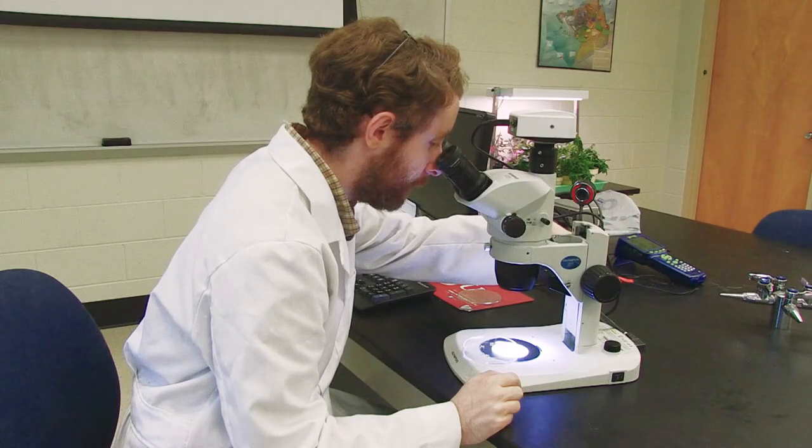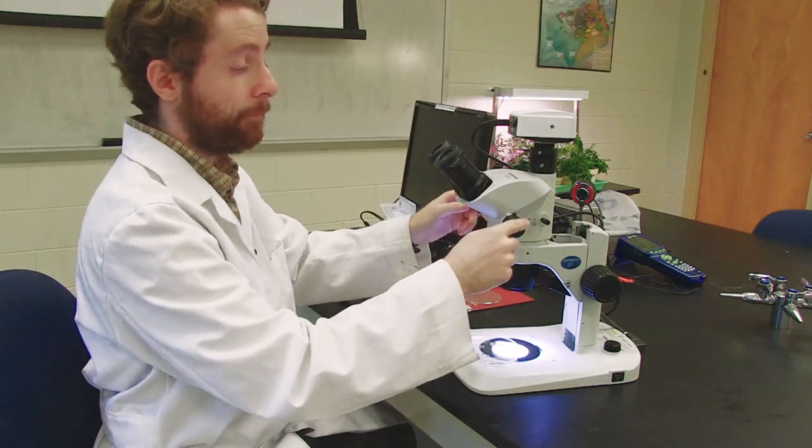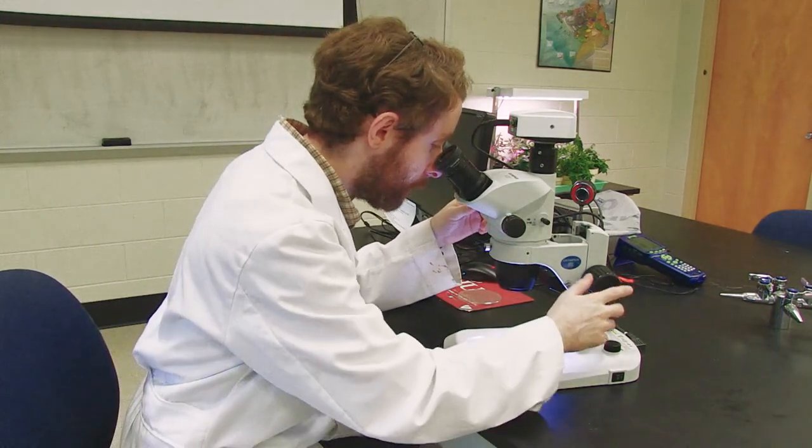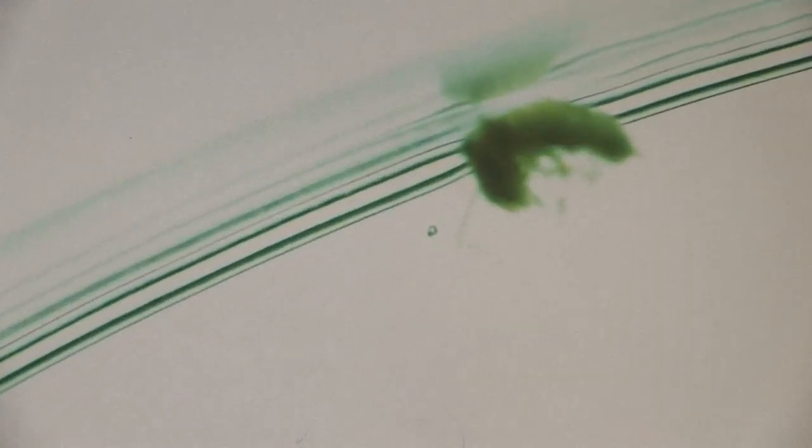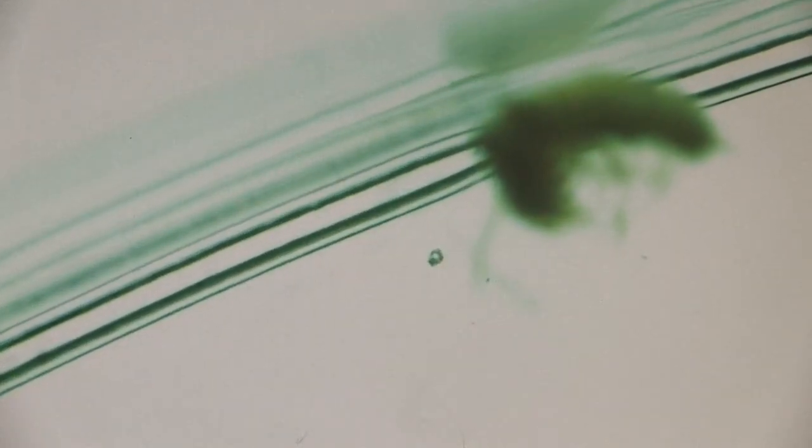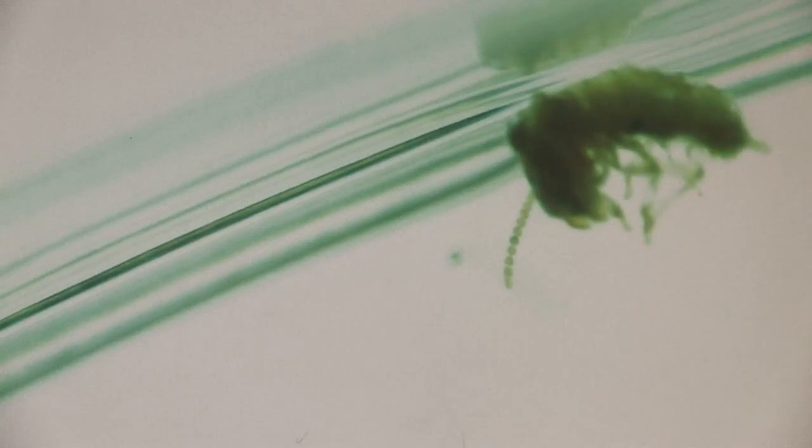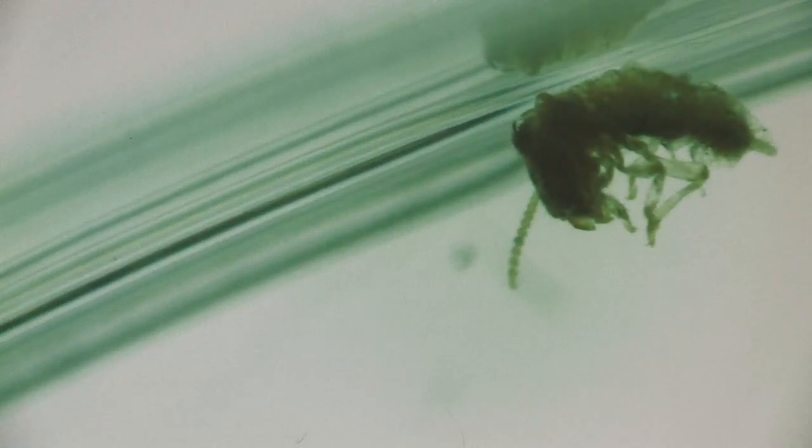My termite is now in focus. So I can now use my zoom knob and zoom in. Again you may have to adjust the focus knob a little bit as you do this. As you can see, I have a termite here. This is a dead termite, it's in water right now. But you can clearly see the appendages and the antennae of our termite worker.